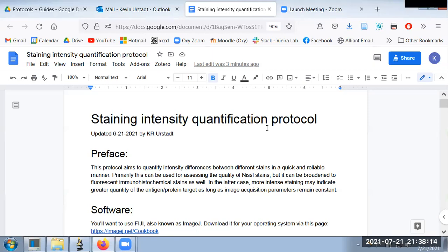In this video we're going to be discussing how we quantify staining intensity in a few different contexts. We might want to do this if it's not just as simple as counting stained elements in a picture. Sometimes the particles are not always the same brightness or the same staining darkness, so we need to know where those differences are. This tends to be used for things like gel electrophoresis, western blot, staining intensity of bands, but we can also use this in brain tissue or different types of tissue sections.